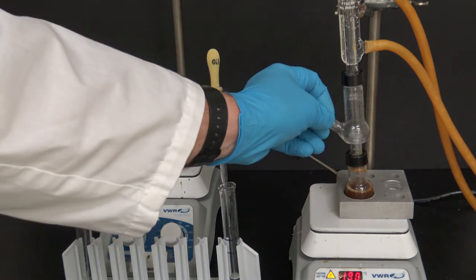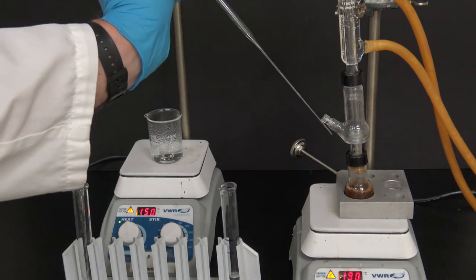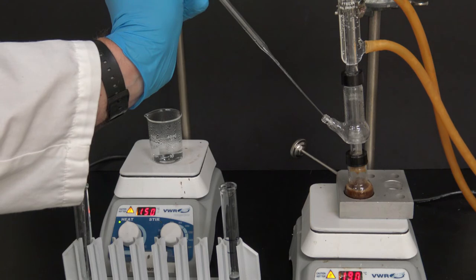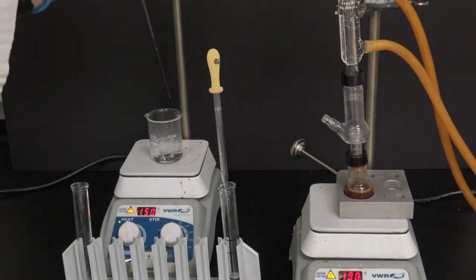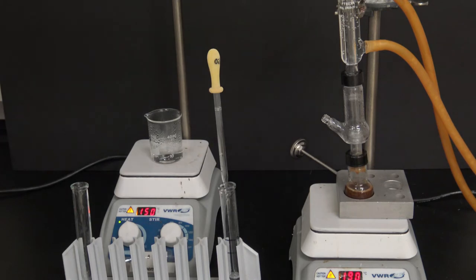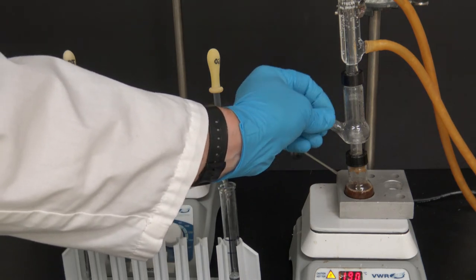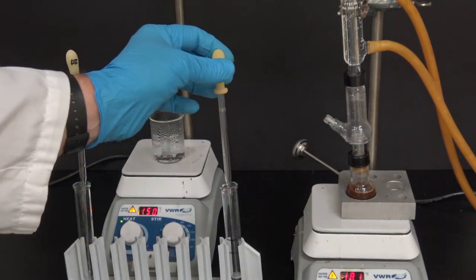We're going to now remove some more. This will be the third time that we've removed our distillate from our Hickman still. Going to remove the distillate for the fourth time.